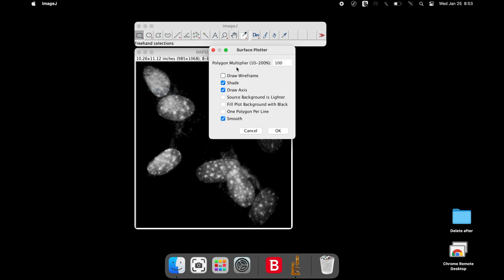In the Surface Plotter dialog box, keep the polygon multiplier as 100%. Check on the Draw Wireframe, Shade and Draw Axis. Optionally, one can also check on Smooth and then click OK.